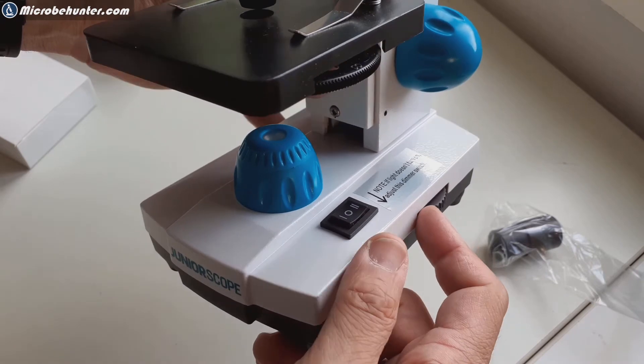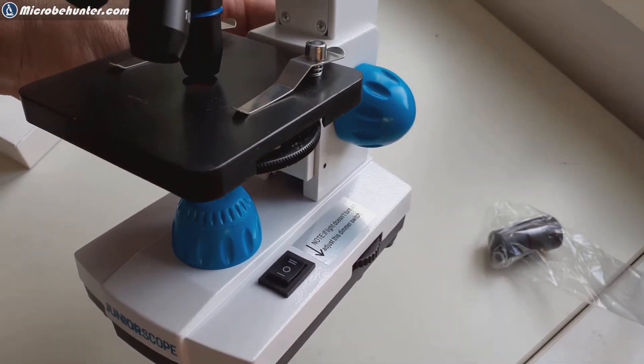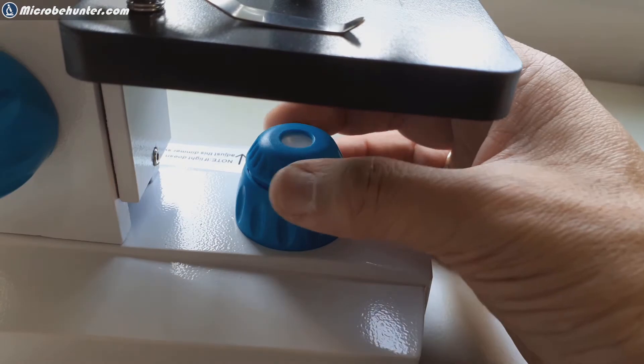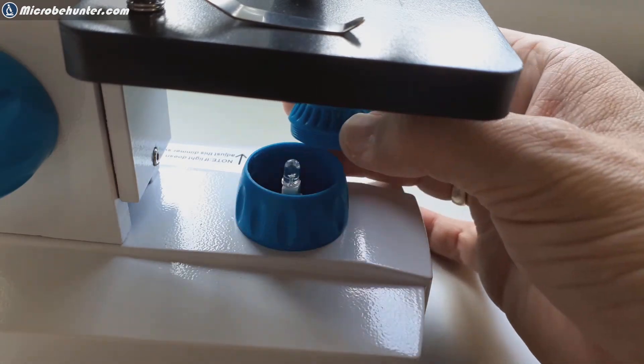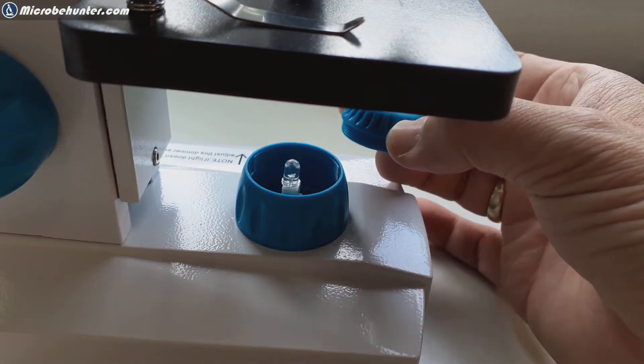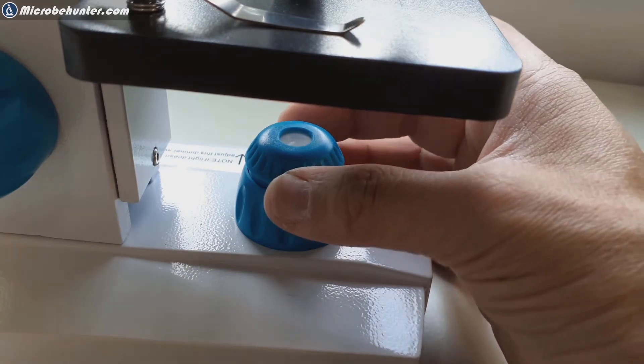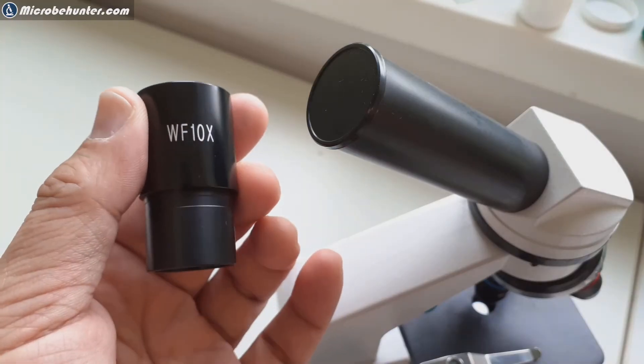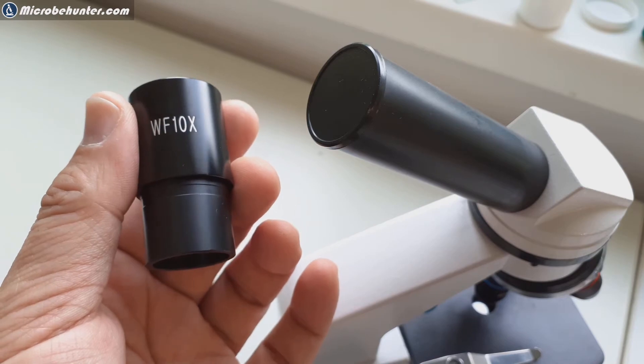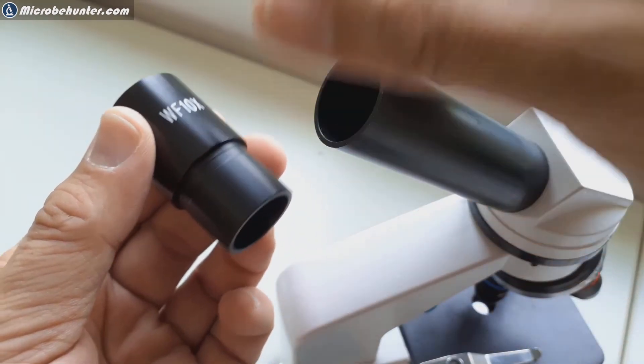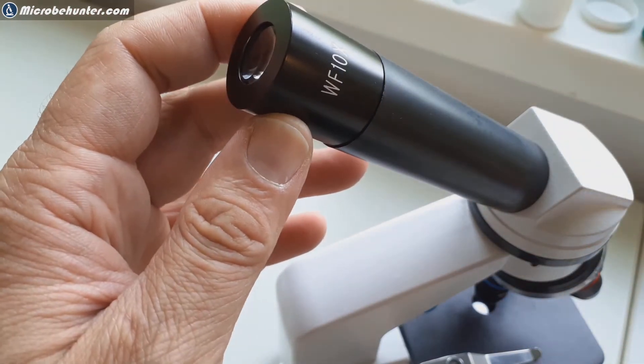The LEDs can be exchanged as a matter of fact. I was checking for that not that it's necessary to exchange them but I generally like the serviceability. It's a standard 10x eyepiece, it's a glass eyepiece that I've also found on another microscope so the quality is quite fine.